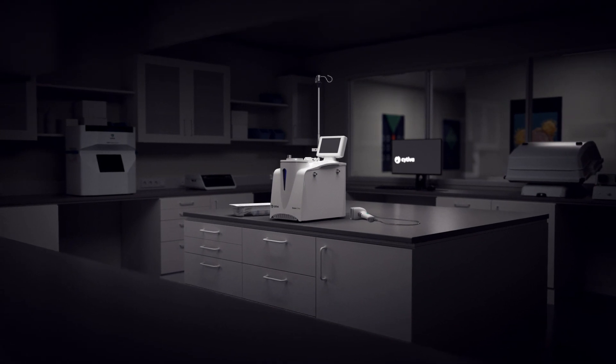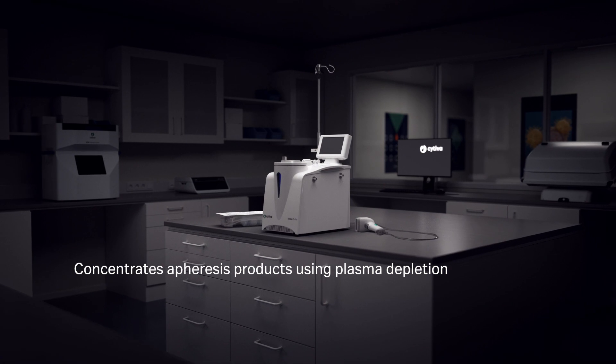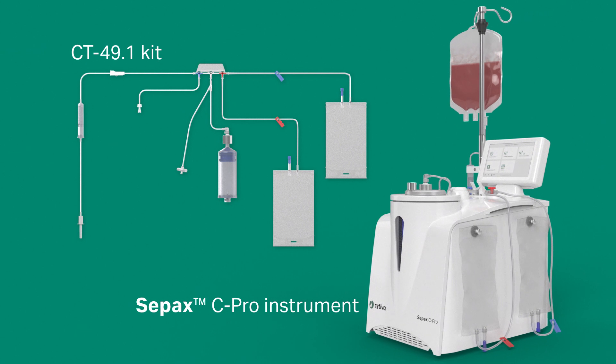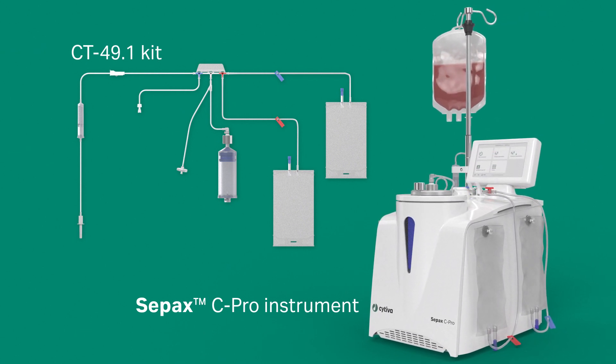The Paracel C-PRO application concentrates apheresis products using plasma depletion. It works in combination with the CPAC C-PRO instrument and CT49.1 single-use kit.